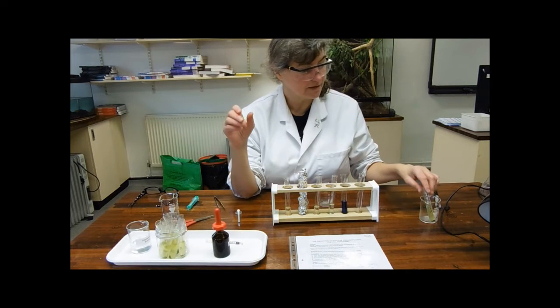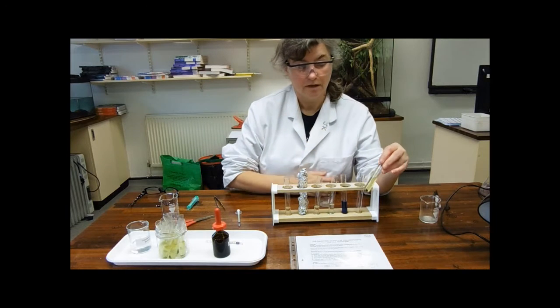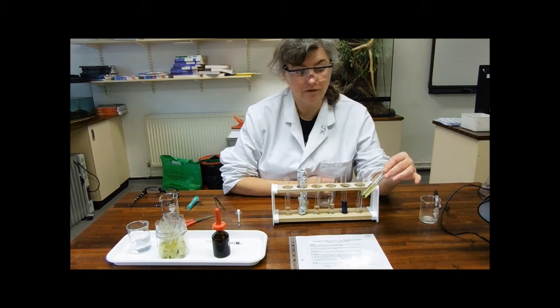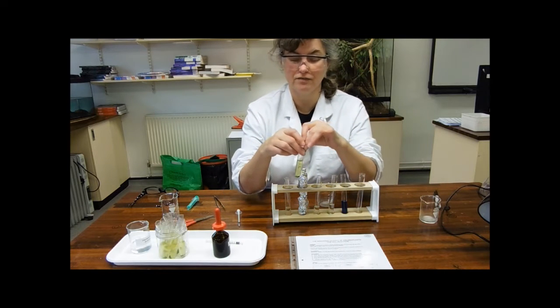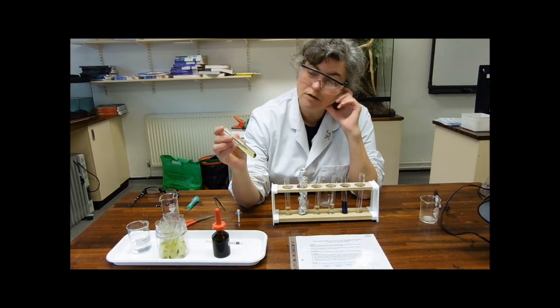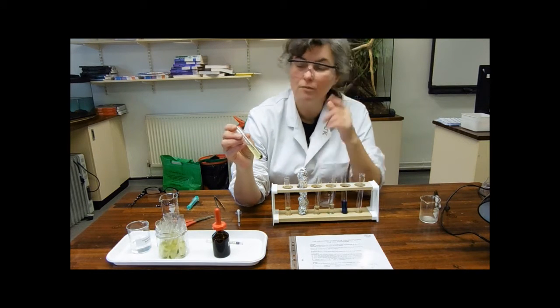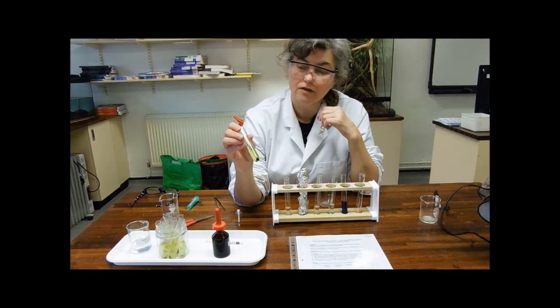In preparation, spinach leaves have been ground up and then centrifuged to within an inch of their lives. In this tube, what you're seeing, that dark green blob right at the bottom, are the chloroplasts.